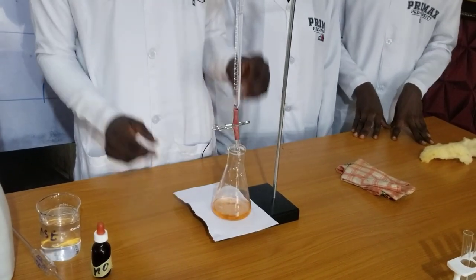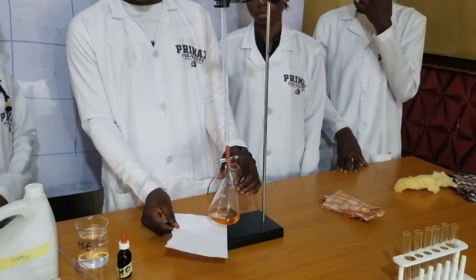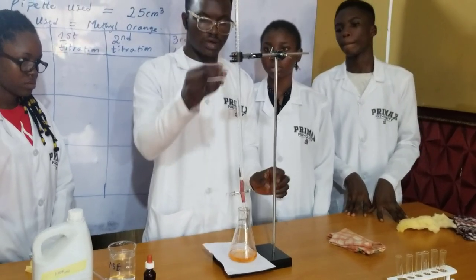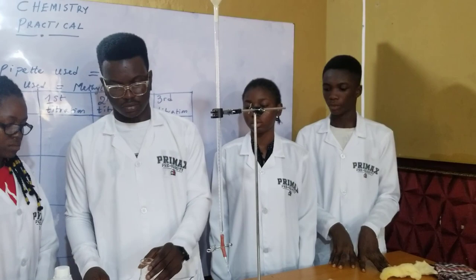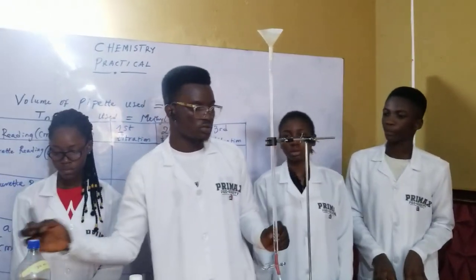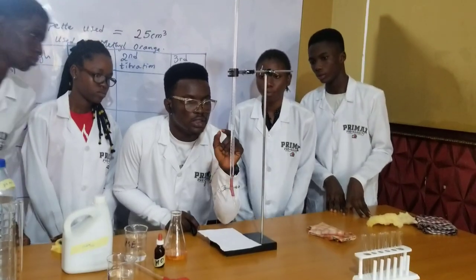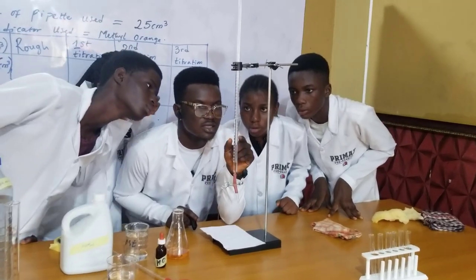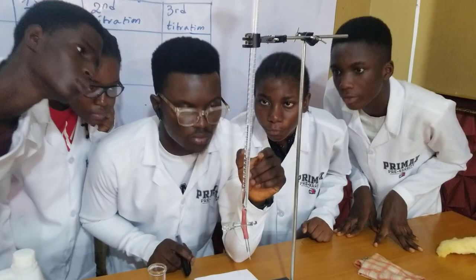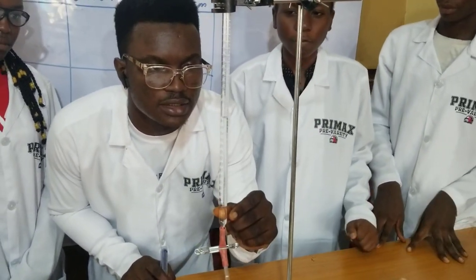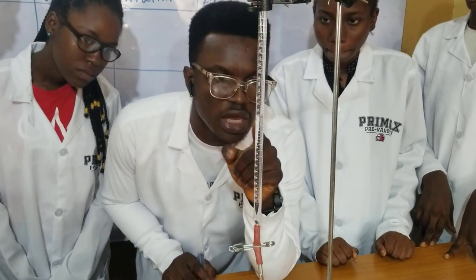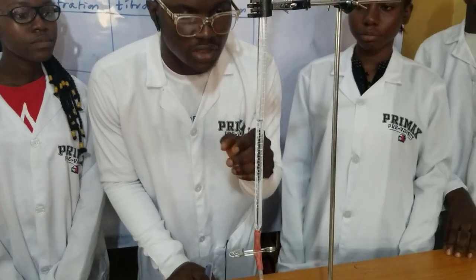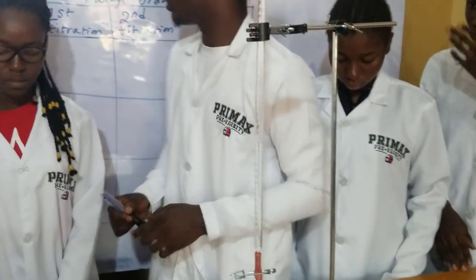That is different from what we started with. This white paper is here so we can see the color clearly. Now we have a color change, and we will take our final reading. The reading is 36.50. You avoid error due to parallax — look at the base of the meniscus. Between each whole number there are 10 lines, so that's 36.50.